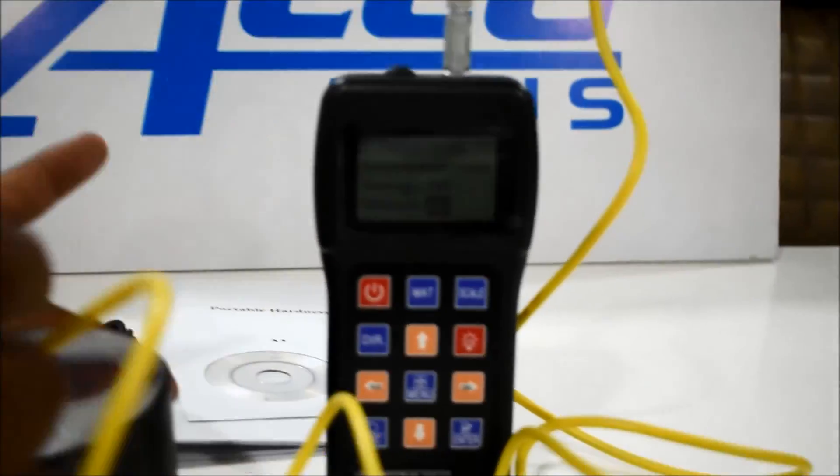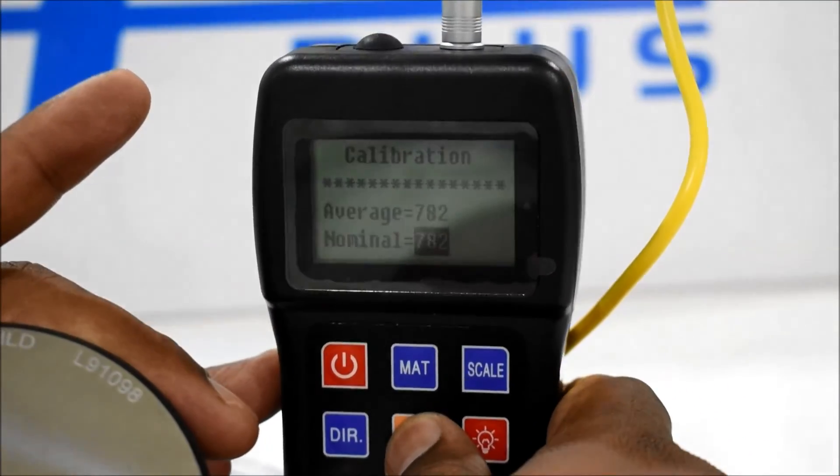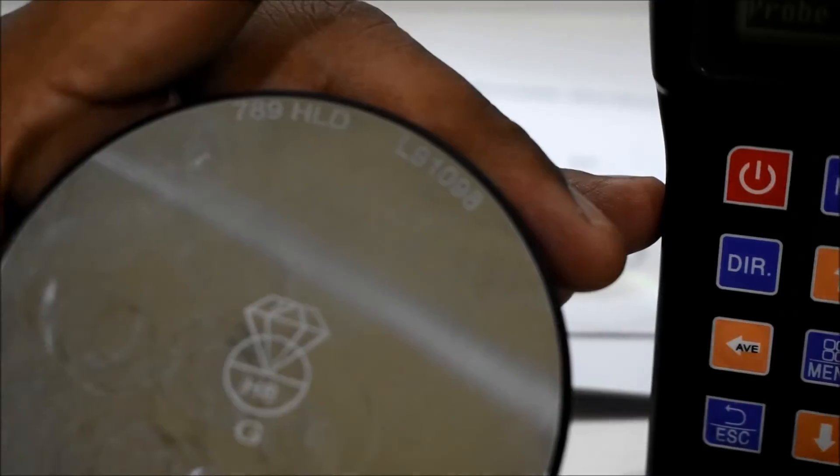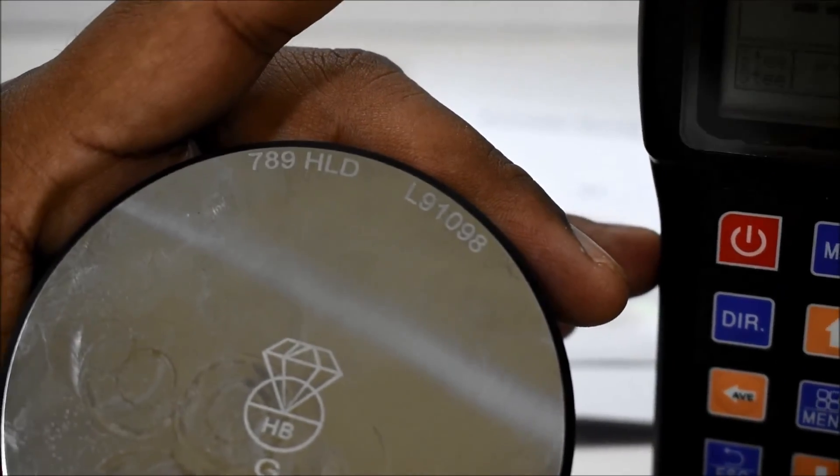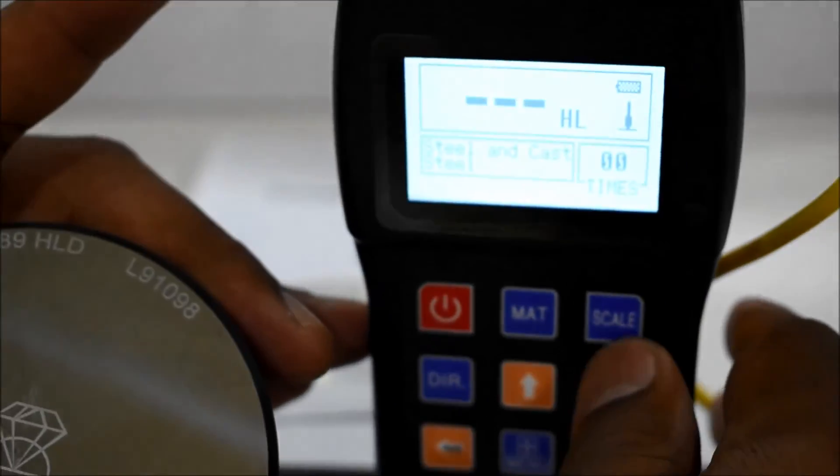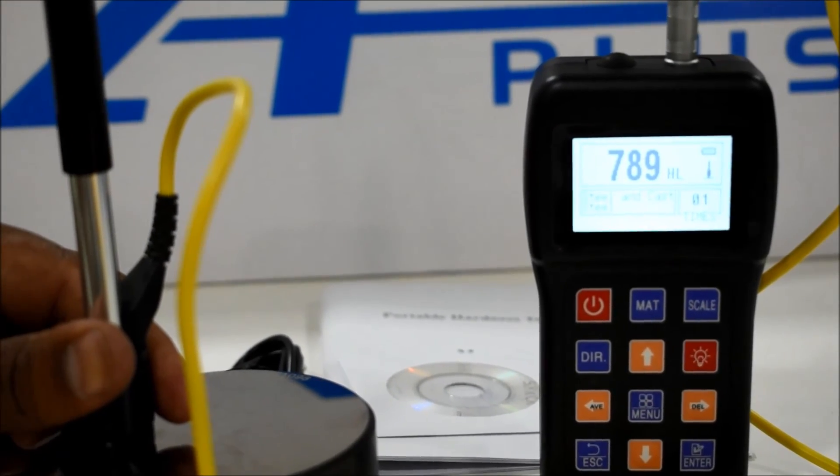Then you can get the average reading of 782. If you want to normalize by 789 to calibrate this instrument, you can do the reading. Done.